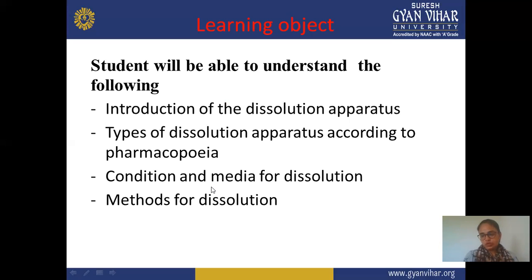Next, conditions and media for dissolution: which condition or which media is required to perform this dissolution test, and how we prepare this media for dissolution testing. Next is the method of dissolution, how we perform this dissolution, the method and procedure of the dissolution study. That is all you study in this lecture, in this dissolution apparatus PPT.